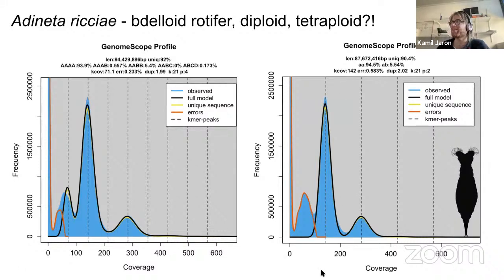This is just weird. This is a bdelloid rotifer. It was not done on a single individual. It was done on a pool, but it's also very, very unlikely that, because it's an asexual species, there was all that much diversity. And you cannot actually explain it by population diversity, because if the population had a variable number of chromosomes or variable ploidies or whatever, you would never see them evenly spaced. Do you remember when the stoichiometry works? When all the content is within the same cell. Otherwise, it just goes by the relative frequency of the cells. Right? I would just like you to appreciate that this is weird.